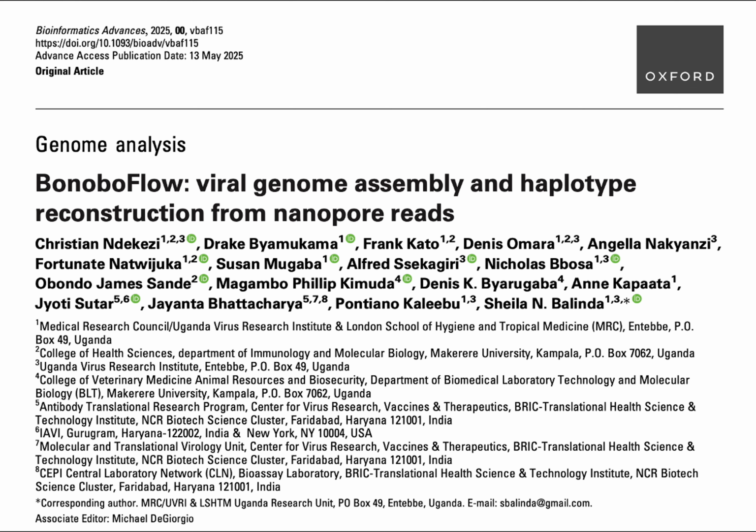Makes sense. Then, if you've sequenced multiple samples together in one run, which is common... To save time and money. Exactly, needs to sort them out. That's demultiplexing. It uses unique barcodes assigned to each sample to put the reads into the right bowl, so to speak. Okay, sorted ingredients. But you don't want any impurities, right? Like host DNA getting mixed in with the virus. Absolutely not. That's the next crucial step, contaminant filtering. It uses a reference genome, say, the human genome, if you're looking at a human sample, along with tools like Minimap2 and SAMtools. It intelligently identifies and removes reads that match the host or other known contaminants. Sifting out the junk, leaving you with just the desired viral reads, focusing on what's truly relevant.